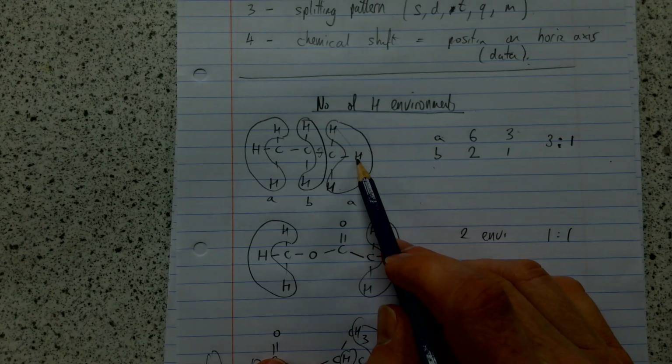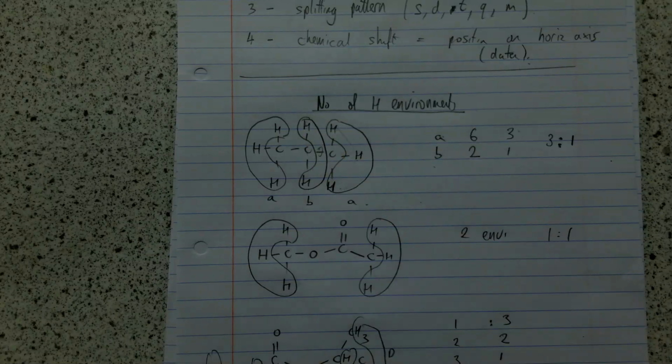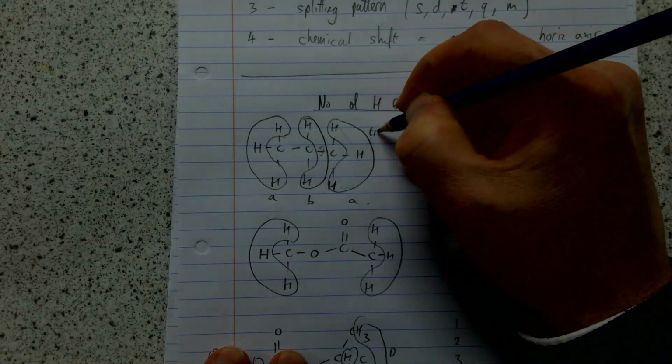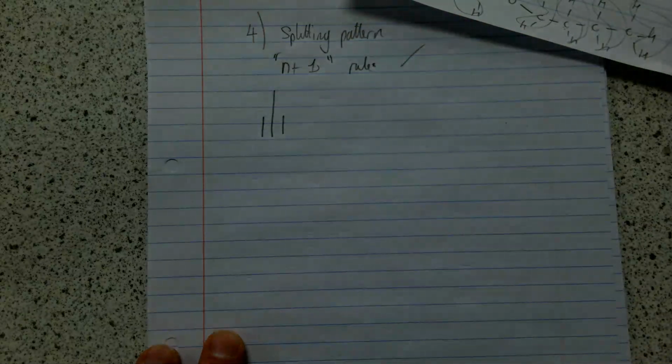Adjacent just means next door, if you weren't aware. So there's 2 hydrogens on that. 2 is n, n+1 is 3, so it is a triplet. These 6 hydrogens appear as a triplet in a spectrum, and a triplet looks like that, 3 peaks.